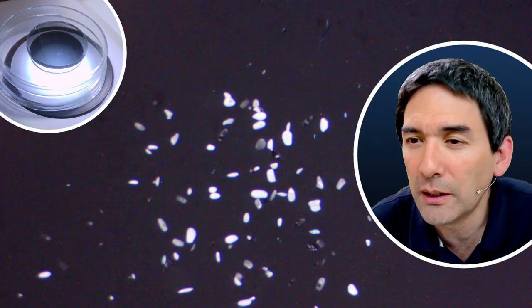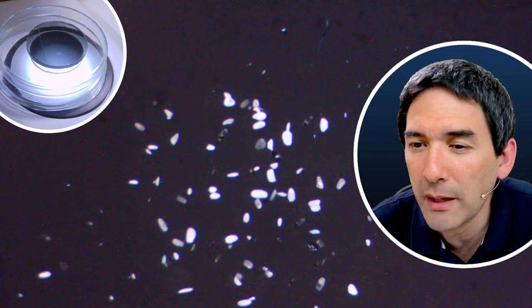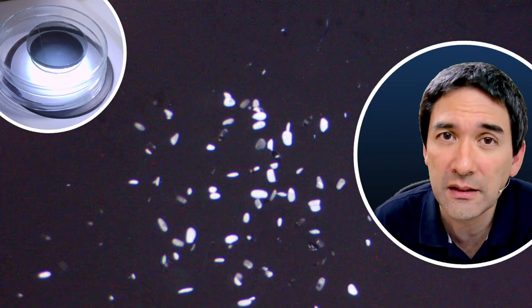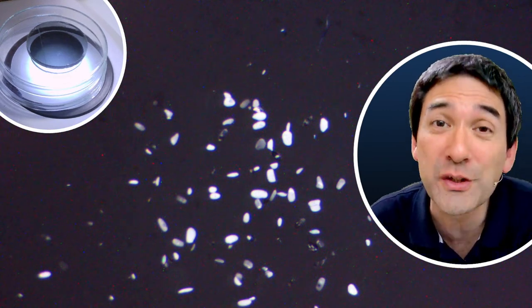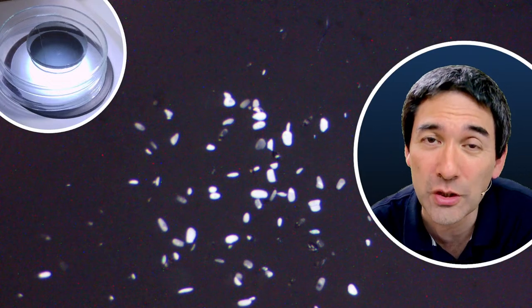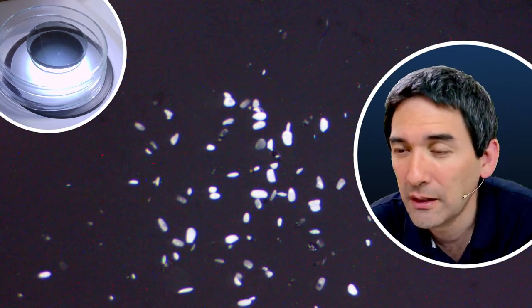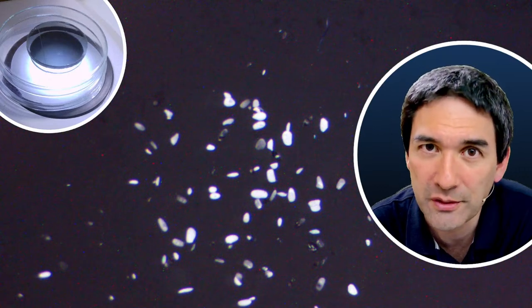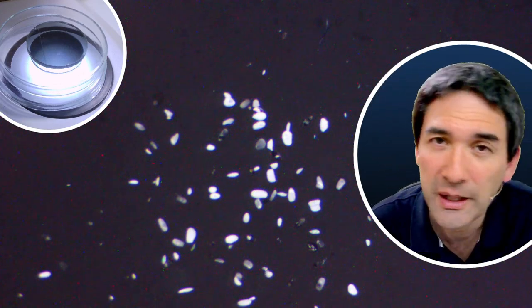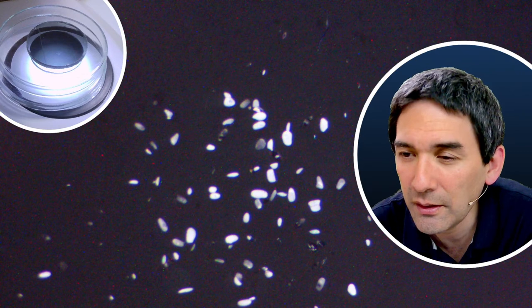Okay. So I'm going down here again. Please, could you do a review of the Zivboni microscope? I don't have this microscope. But what I can recommend generally is that many microscopes concerning the features are very similar anyway. So usually in a certain price category, there are not so many differences. And if you just look for the microscope which has certain features that you like, then in most cases, it'll be fine. There cannot be so much variation within microscopes. I mean, it's got to have a condenser, it has the objectives, of course. Some objectives are better than others, but for most microscopes, they're relatively similar.